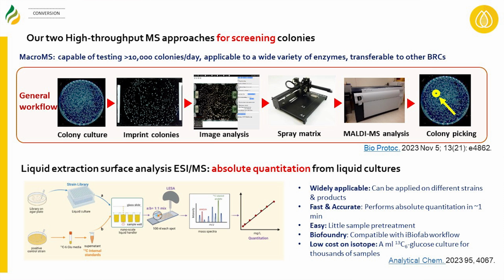And so a lot of this is how to get your sample. So when I talk about the sample, by the way, I have to admit, this has nothing to do with how long it takes you to prepare the sample. If that takes you 5 minutes or it takes you 5 years, that's not on me. So when I say a second per colony, and then of course there's a lot of informatics, and we're still working with a lot of groups on how to deal with that.